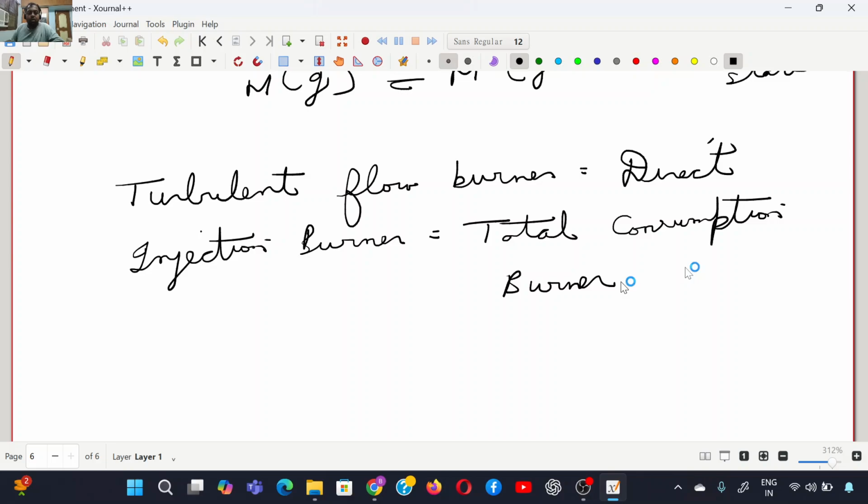Optical components, I already told you about the concept of resonance lines, why we use monochromators, etc. The optical path is from the hollow cathode lamp to the flame to the entrance slit to the prism or grating to the exit slit to the detector. Okay, I'm just checking from source notes what is relevant to explain and what is not.